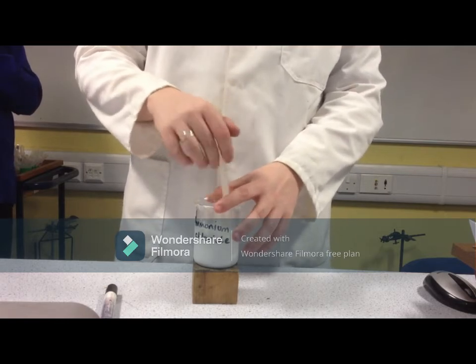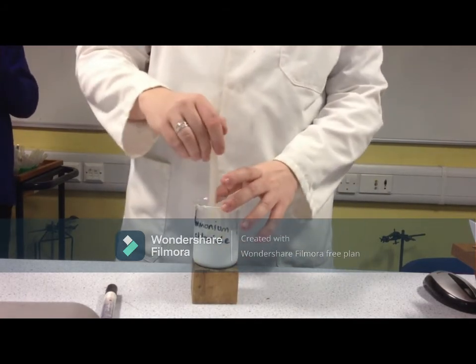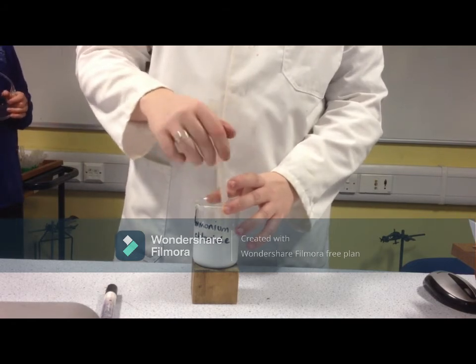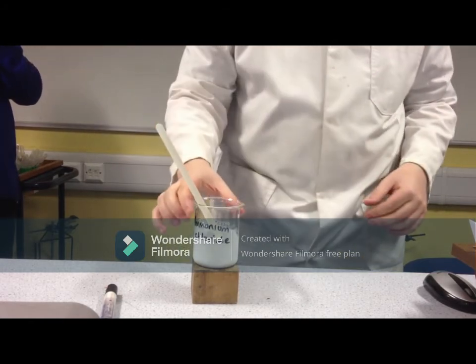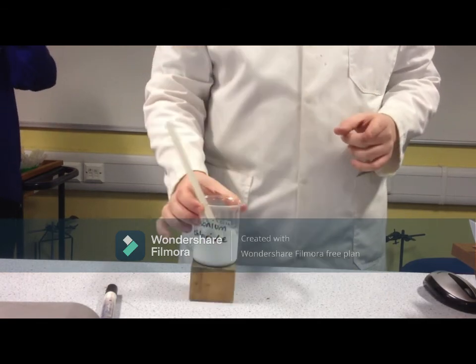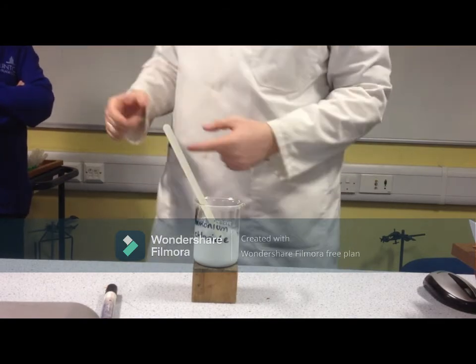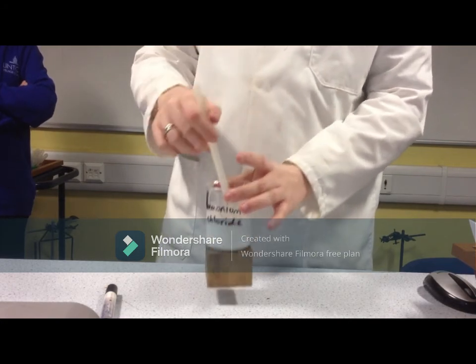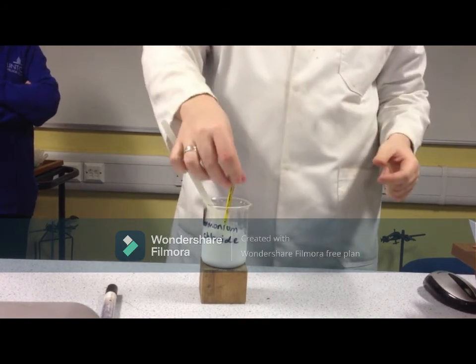So the chemicals will actually mix to initiate the reaction. It actually happened quite rapidly. But because a lot of chemicals are added, you can see that he can lift up the beaker easily. Why? Because the water beneath the beaker has frozen and stuck to the beaker so that the whole structure can be lifted up.